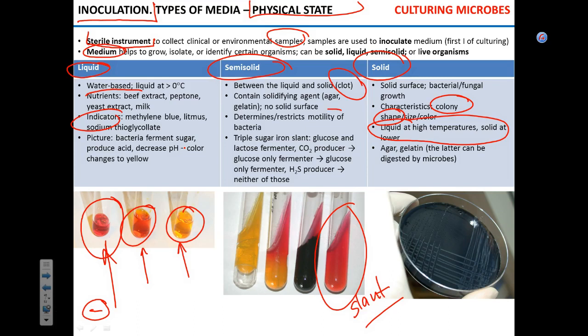First, we can use it to determine bacterial motility. The word motility refers to movement. Imagine that you have this slant, and you collect some bacteria at the tip of, say, a really long needle or a wire, and you pierce this slant with the wire.